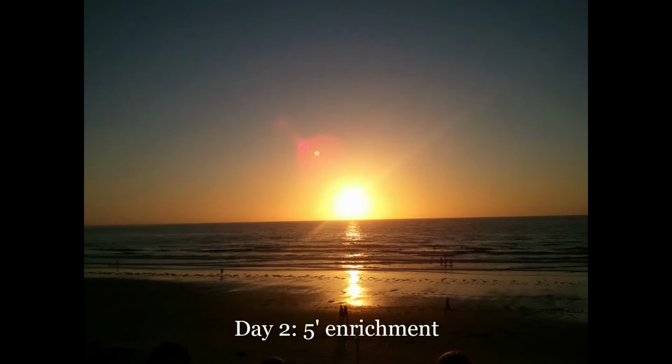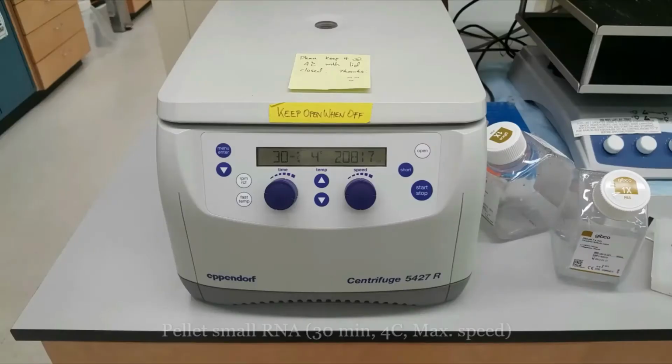The next morning, start by spinning down your RNA for 30 minutes at max speed at 4 degrees. If you do not see a pellet, vortex the tube hard and spin for another 5 minutes. Seeing the blue GlycoBlue pellet is independent of the amount of RNA, so ensure that you recover a nice blue pellet.